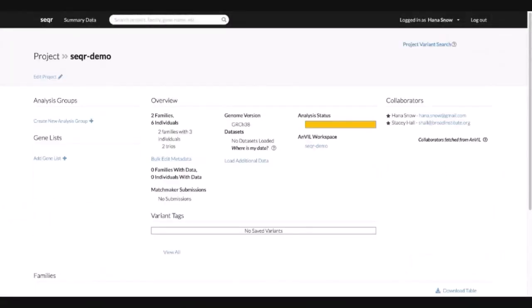This may take a few minutes, and we ask that you do not refresh the page while this is loading. Please note that once this loading request goes through, search will not immediately be available in Seqr. It can take up to a week from the time that you request your loading to when data is fully available in Seqr. You will receive an email letting you know once that data is available.